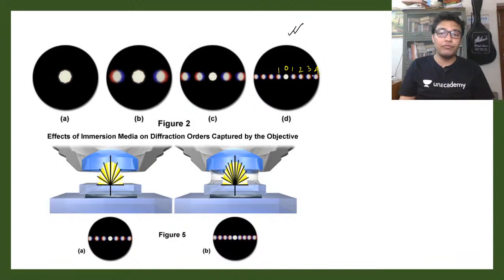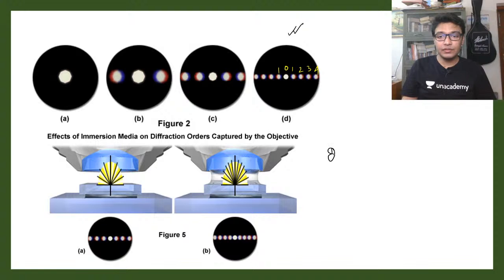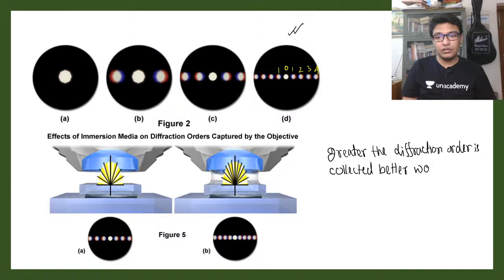At least 4 diffraction orders are collected. Remember this: the greater the diffraction order collected, the better the resolution.